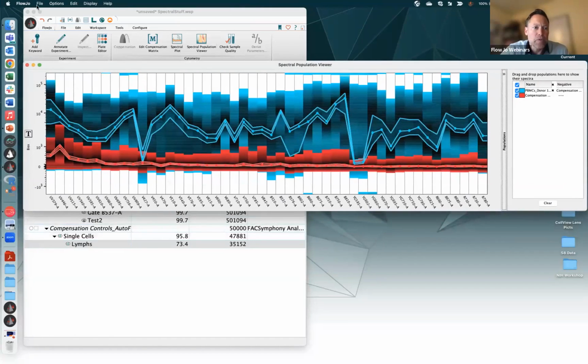A lot of the tools you'll see here are going to be the same. File, export graphics, options. There's a lot of this: how do you want to show the bands, the violins, the density. One that's different here for comparison purposes is the ability to normalize. And so this is not normalized at the moment. We're looking at raw signal.